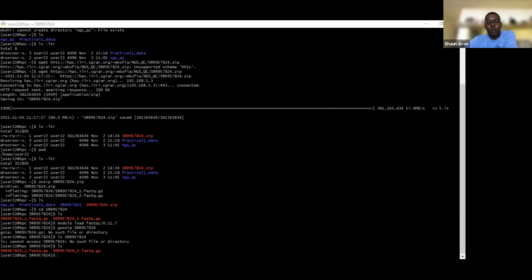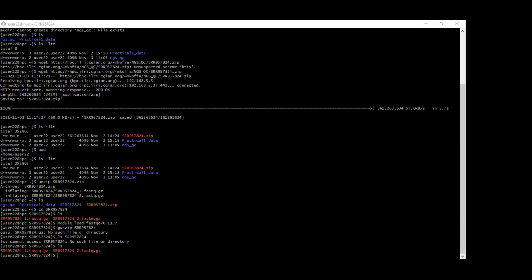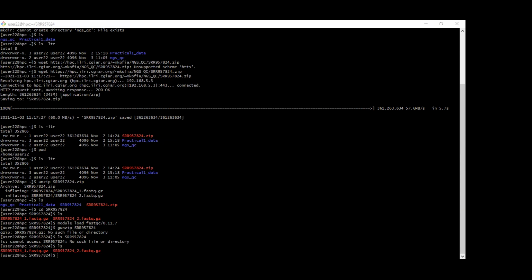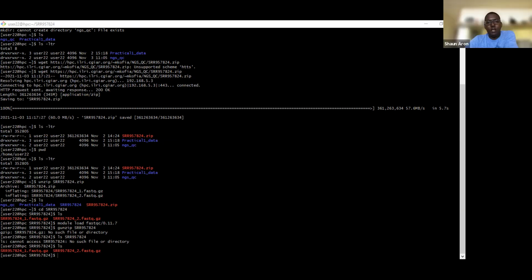I didn't go down, so is this the end? Is there another page which is going down here? Yes, there is this page here. You need to go to the next page. So just skip that first part and go down till you see task 2.